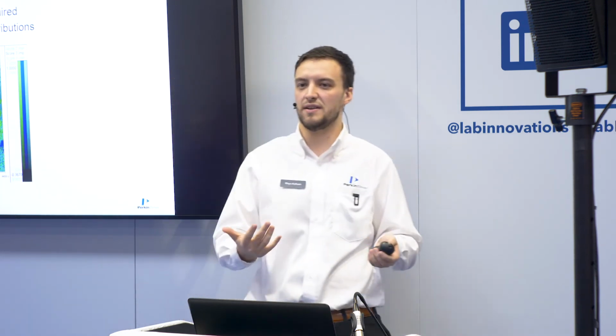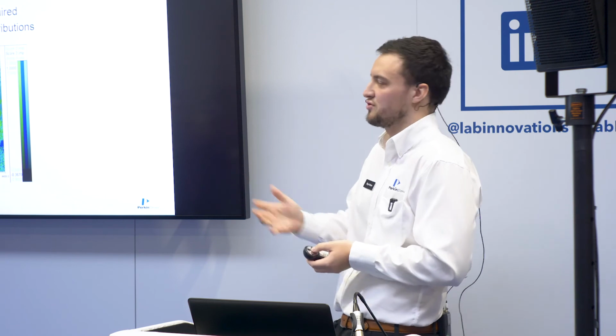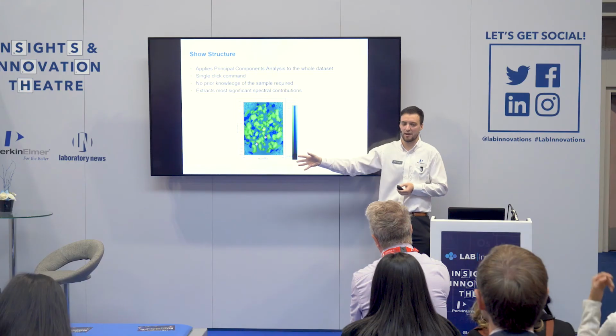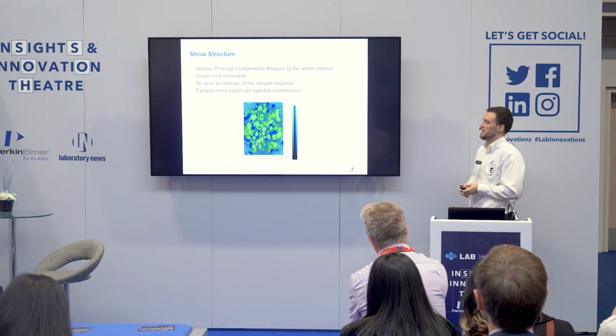As you can see, we've got 3 different colors here, so it's identified 3 main areas in terms of what we're actually seeing in chemistry. So different colors mean different chemistry. So we have green, dark blue, and then a lighter blue on the outside too.